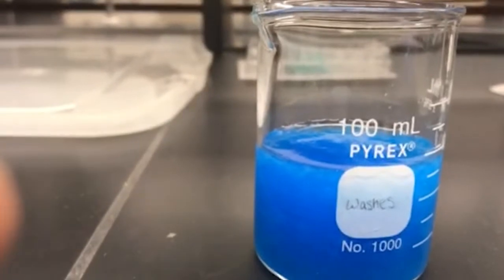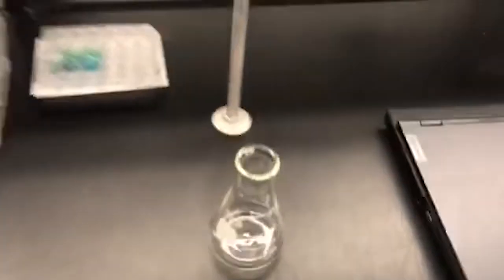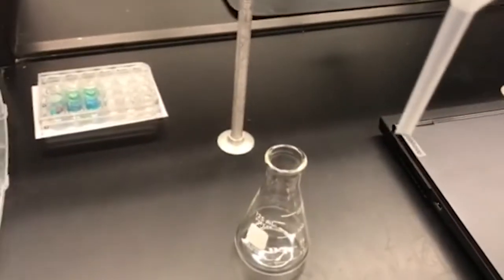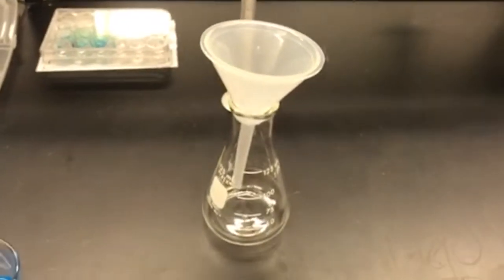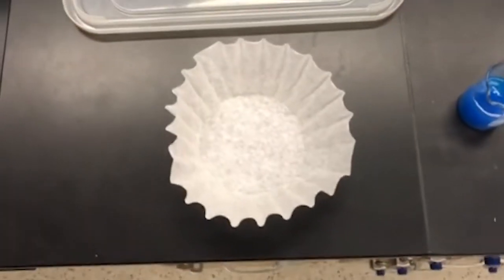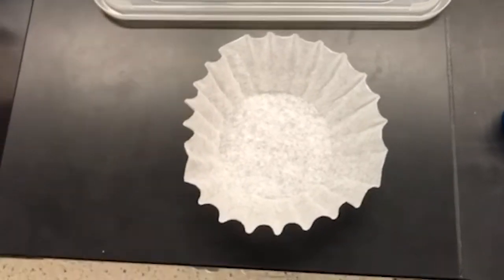Let's try to recover this. We're going to set up a gravity filtration apparatus. The way that we're going to set that up is by taking this funnel and placing it onto that Erlenmeyer flask. Next, we're going to take that coffee filter and rip the edges off of it.